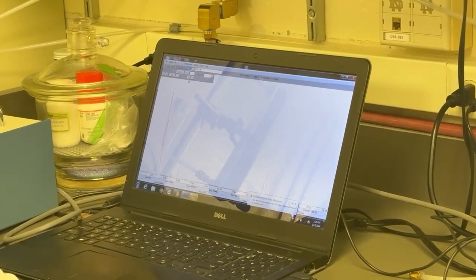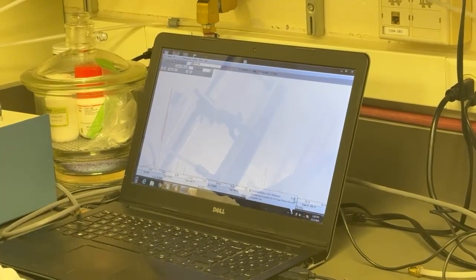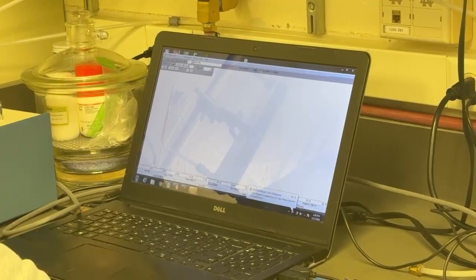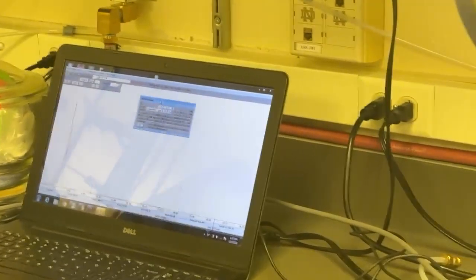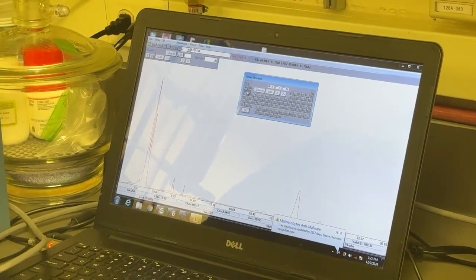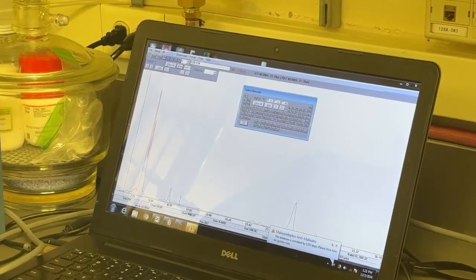So now the next step is to find out what those peaks are that we are generating. Let's go to this periodic table here. This technique has some limitations: it cannot detect elements lighter than sodium. You could start with magnesium. Then we are just comparing the possible spectra with known elemental spectra.